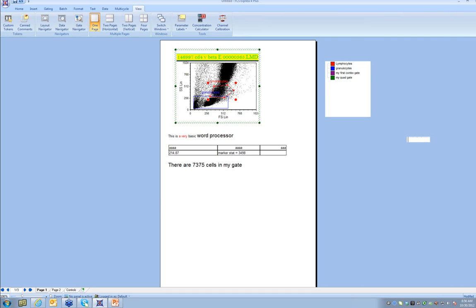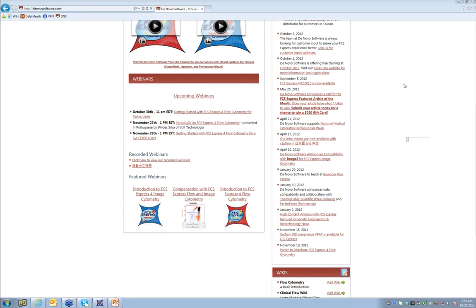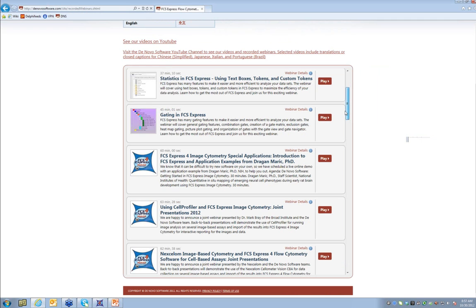We have a lot of other features like batch processing, and we have separate webinars that you can watch, which will show you a lot about some of the different features. To get to the different webinars, go to our main website and scroll down to the middle of the home page, where you see that we have these recorded webinars. Okay? If you go to the recorded webinars page, you can see that we have a ton of different webinars. Many of them involve special applications of FCS Express, like batch processing and many other things.